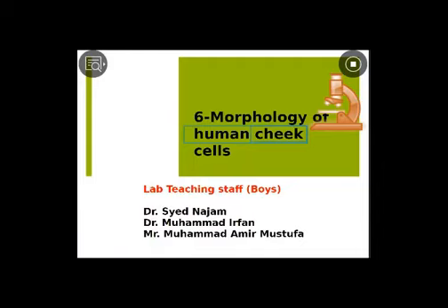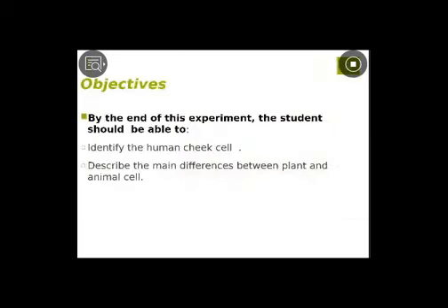Okay, so we make the slide. Today we are going to study human cheek cells and the differences between plant cell and animal cell. These are two objectives, two أهداف حق التجربة.